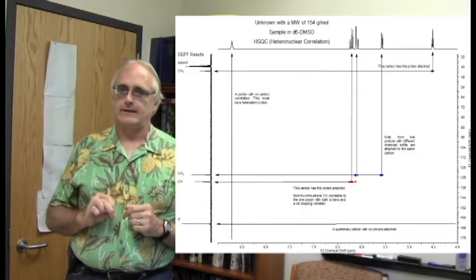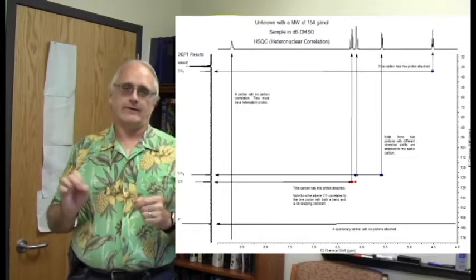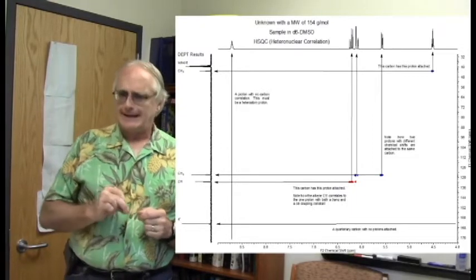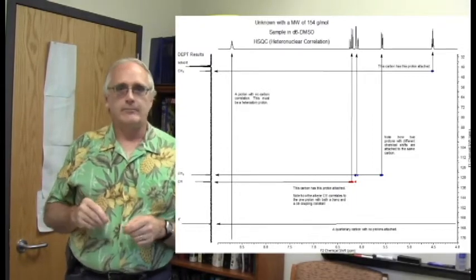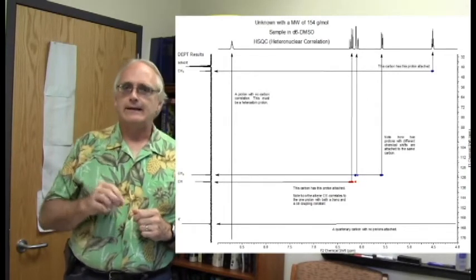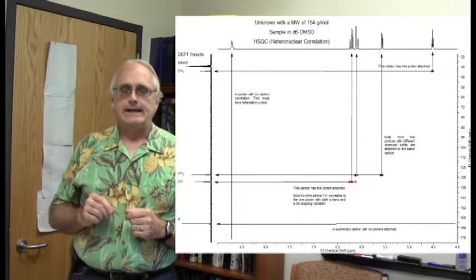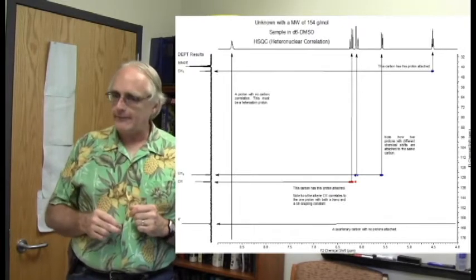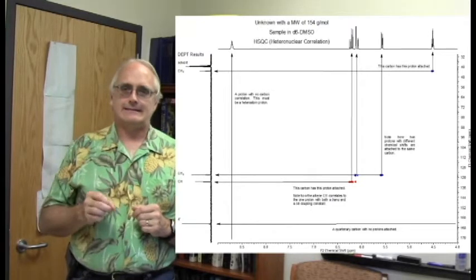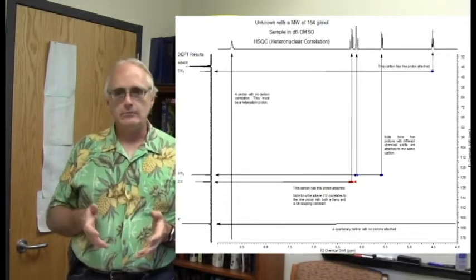That's rather fascinating. We've seen hydrogens on oxygens at various positions. They can vary quite a bit depending upon the solvent and how wet the sample is and things like that. This one's all the way up at 8.7 ppm, and we have pretty good evidence that these integrations aren't 1 to 1 to 1 to 1 to 1, but 2.